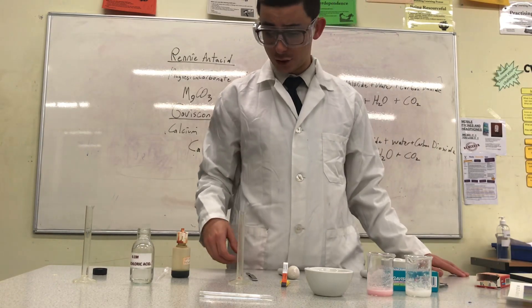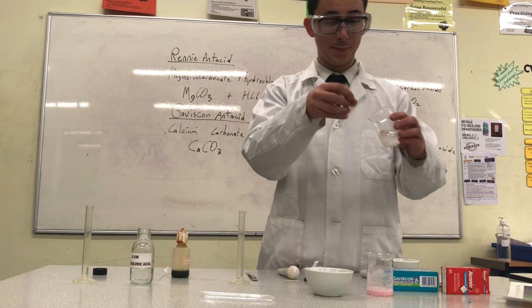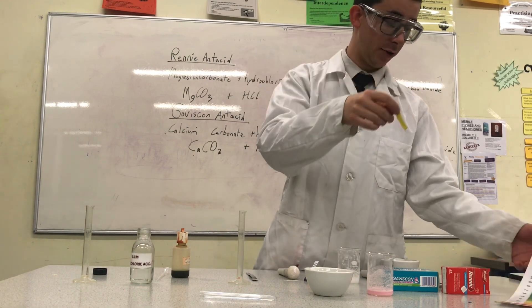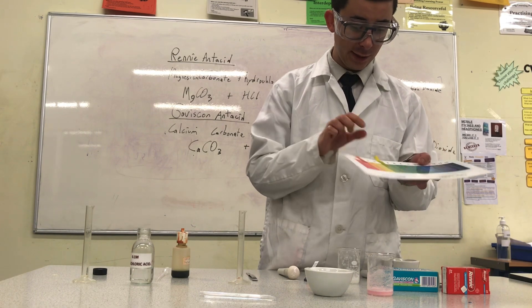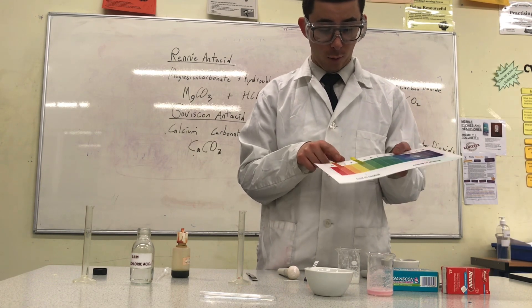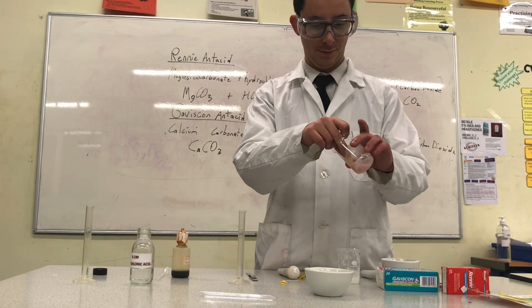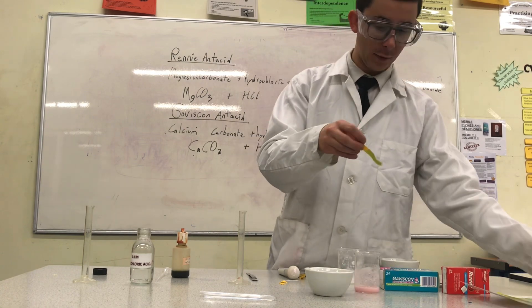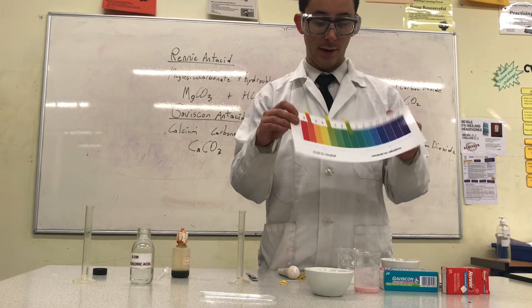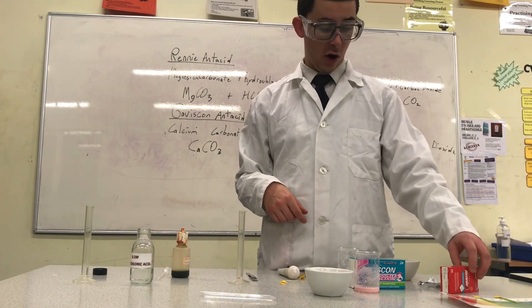I will now test the pH of each solution again. When I put the indicator paper in the Rennie antacid solution, we can see that it turns a light green, which matches up with a pH of about 4. So it isn't quite neutral, but it has raised the pH of the acid from 1 to 4. Now I'll try another strip in the Gaviscon antacid. Comparing the two, it's a slightly darker green, probably indicating a pH of around 7. So we can see that the Gaviscon completely neutralized the acid, but the Rennie did not.